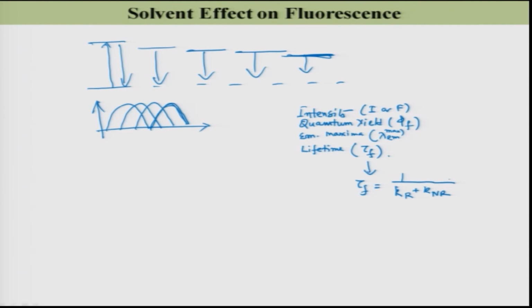But I have not told you how we are going to measure this lifetime, and this is important to get this time resolved emission spectra. So, we have to measure the lifetime. The measurement of lifetime is important in our case.